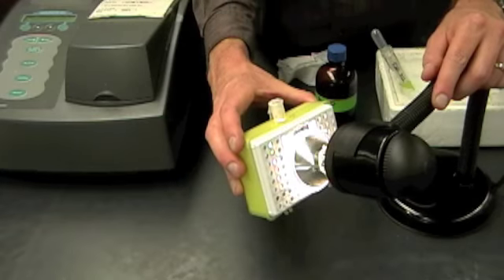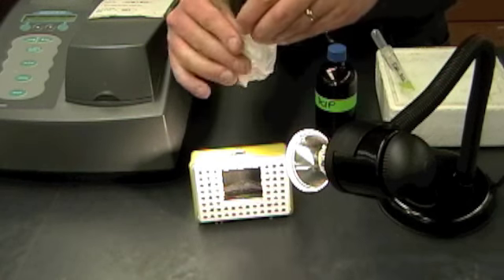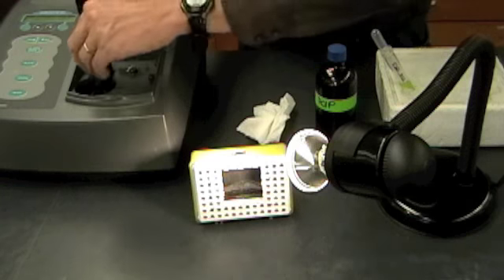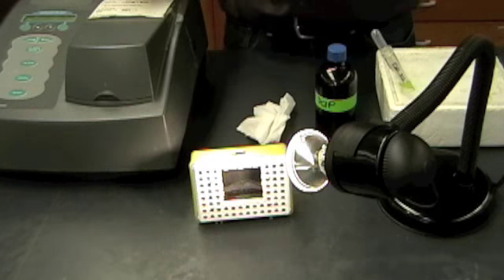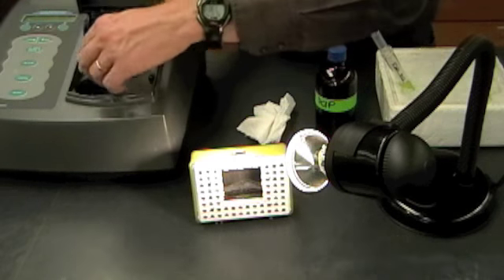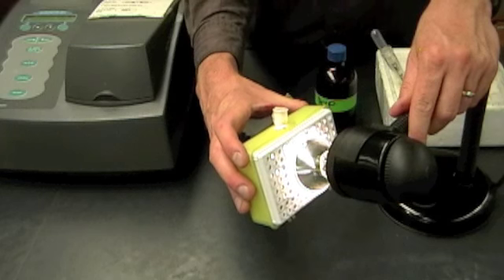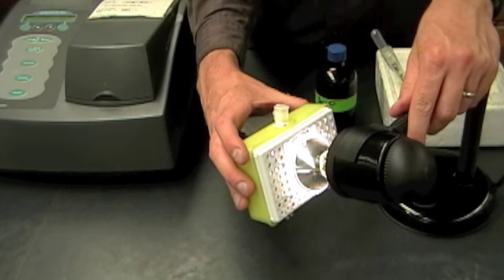Okay, 1 minute's almost up, so I'm going to take this down, pick it up, mix it quickly, wipe off any fingerprints, and get a spectrophotometer reading. Don't wait for this to stop because it's going to be changing as it goes. Once you have the spec reading, this goes back in the chamber and back up at the light for another minute. And you're going to take readings every minute for 10 minutes.